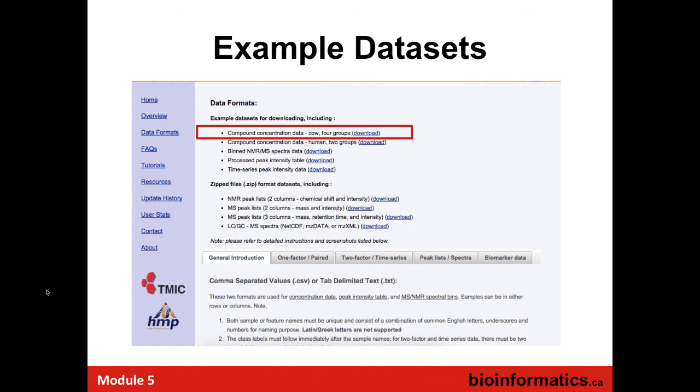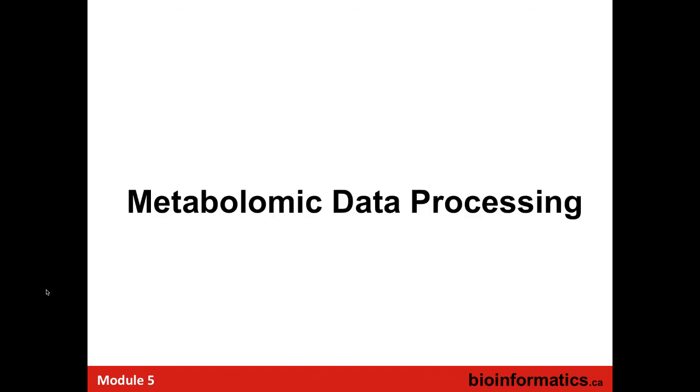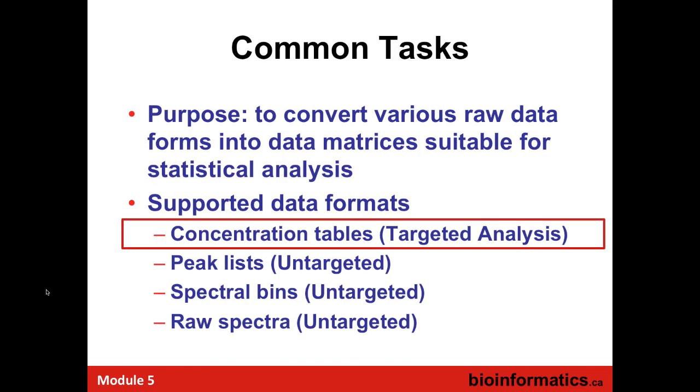So you can download them if you wish, or you can also use an interactive tool, which, as you get in, also has example data sets for each of the specific analyses. And again, that's very useful for people to get a feel for how to use MetaboAnalyst. So let's get into some metabolomic data processing. So you've found the MetaboAnalyst data site.